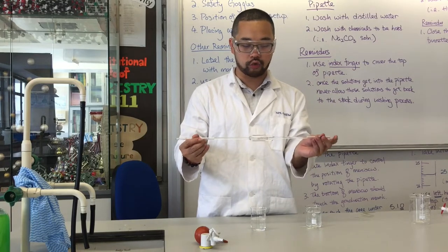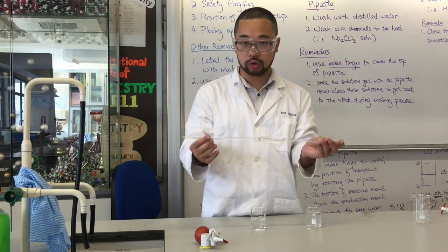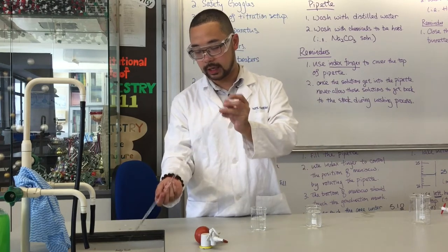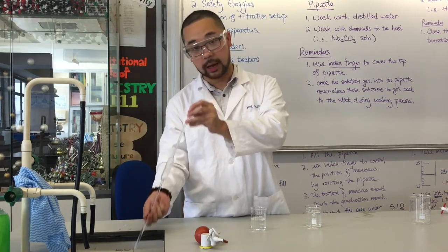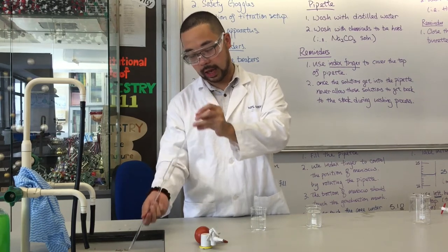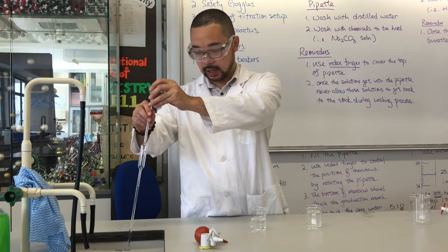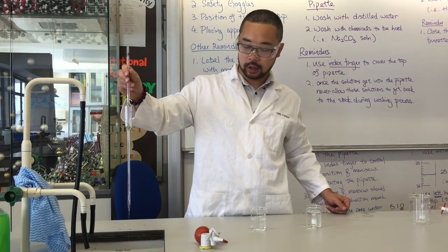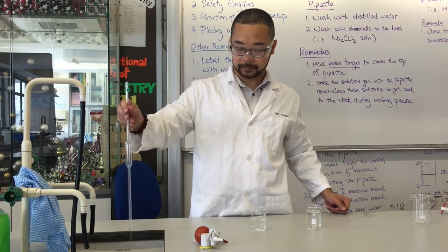After you wash it and rotate it, you can go to the sink and let the water drain off like this. At the same time, you can shake it a bit to make sure the dirt inside or the chemical previously used is rinsed away. So this is the first time using water to rinse the pipette.